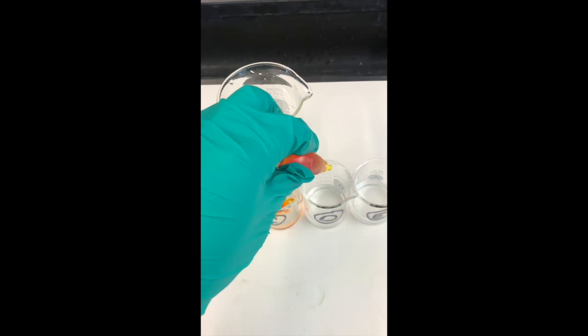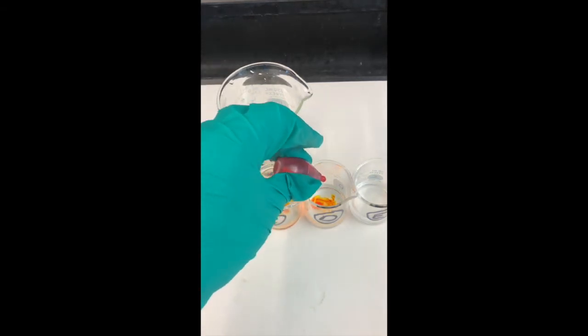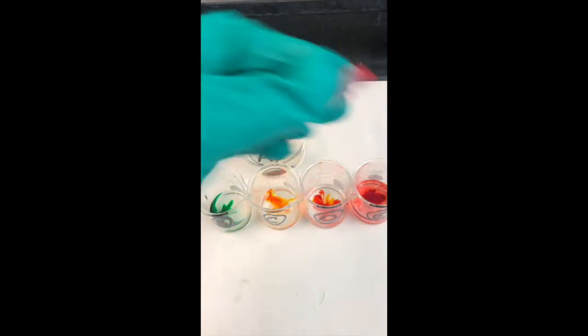We're going to want to try and do a half a drop, if you can, in D of yellow, and then a half a drop of red in D. That's to make orange. And we're going to want 2 drops of red for E. Oh, there's 3 on accident.